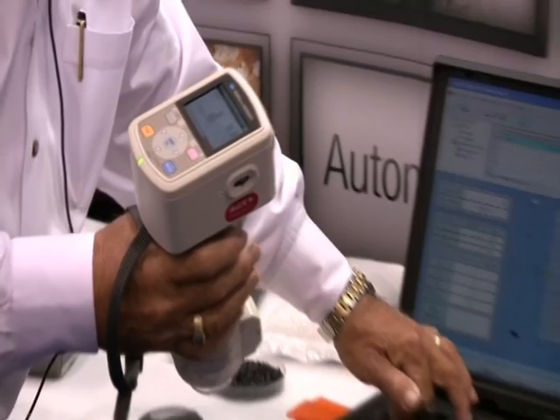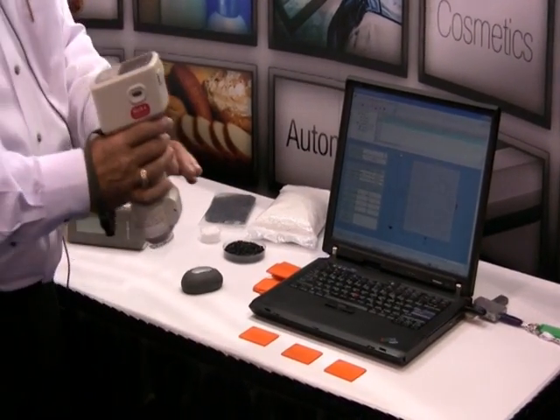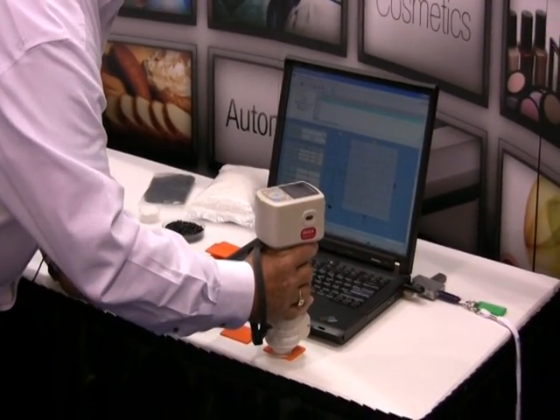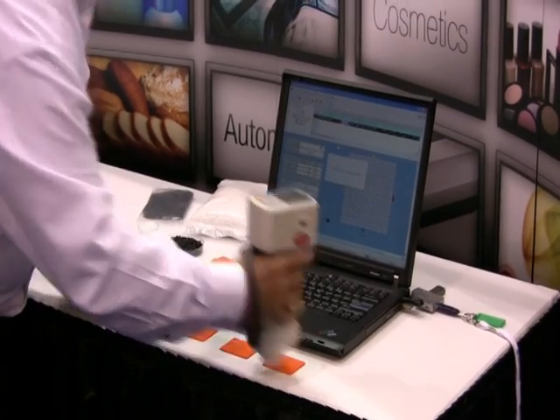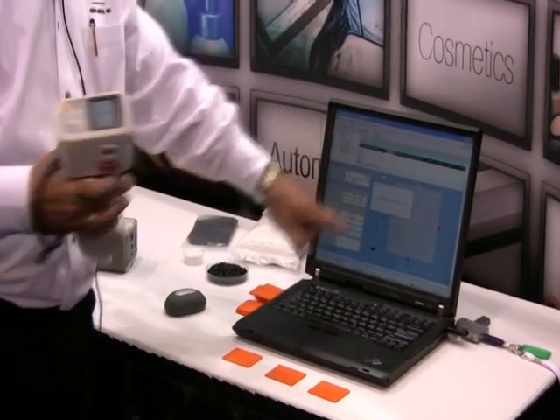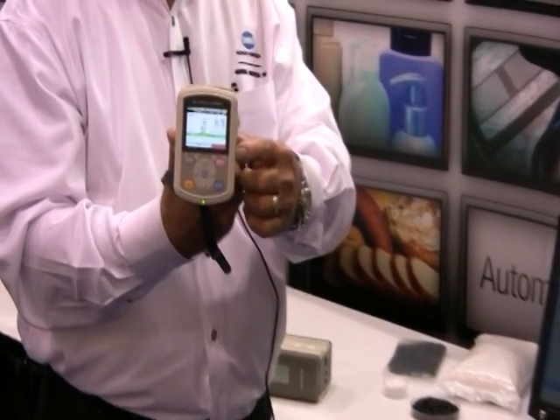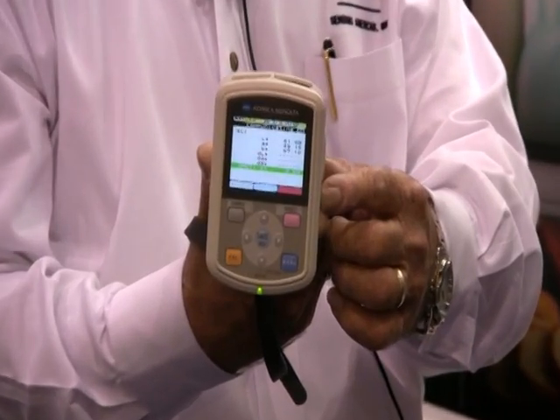I am now going to measure a batch sample and compare that to this target color. Put it on top of the sample and press the measure button. The data goes right to the program and it gives me a pass. On the screen here you can see a green line which indicates that this is an acceptable match to the target color.